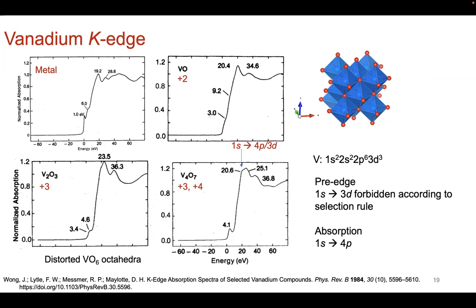Okay, so I'm going to actually spell out the stoichiometry. If you see VO, that's an oxidation state of +2. So what you notice here, all these peaks, these tick marks are all 0. Okay, you start to see the emergence of this shoulder, this pre-edge, right before the absorption energy here.